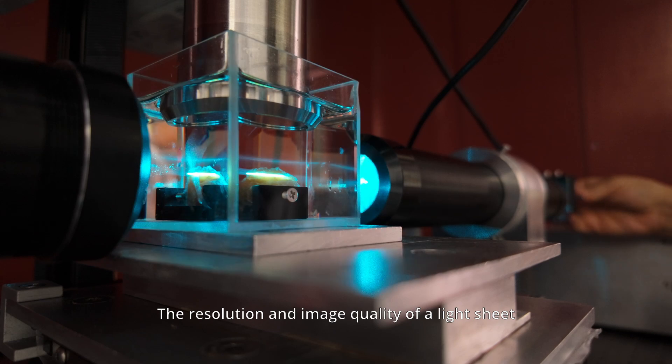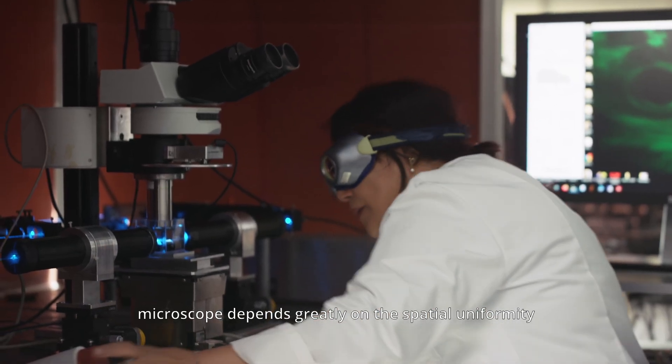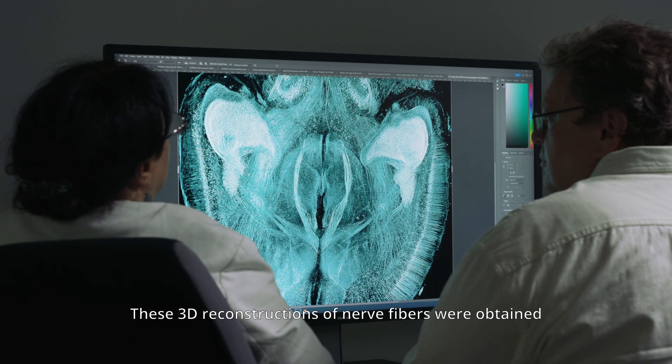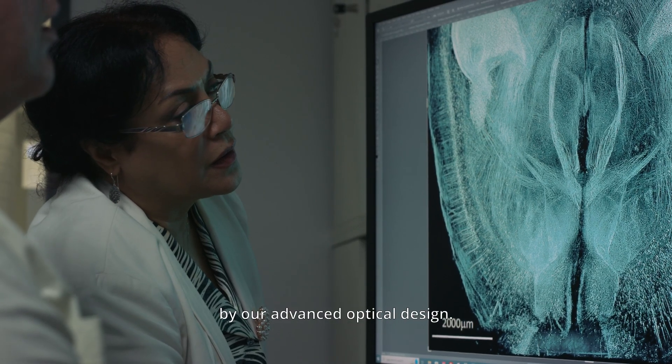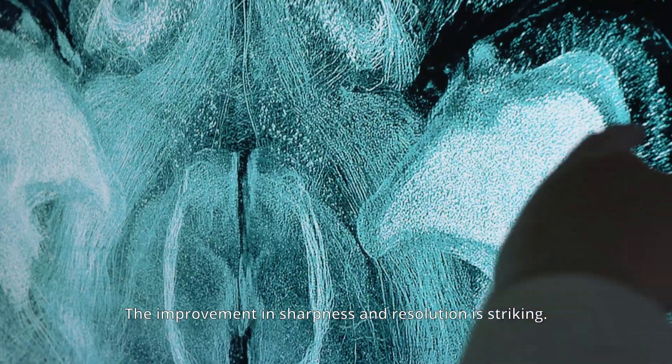The resolution and image quality of a light-sheet microscope depends greatly on the spatial uniformity and the Rayleigh range of the light sheet being used. These 3D reconstructions of nerve fibers were obtained using a light sheet produced by our advanced optical design. The improvement in sharpness and resolution is striking.